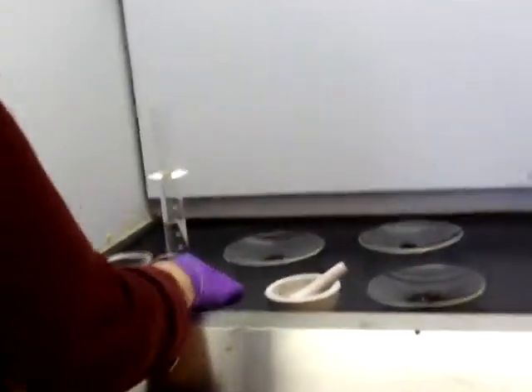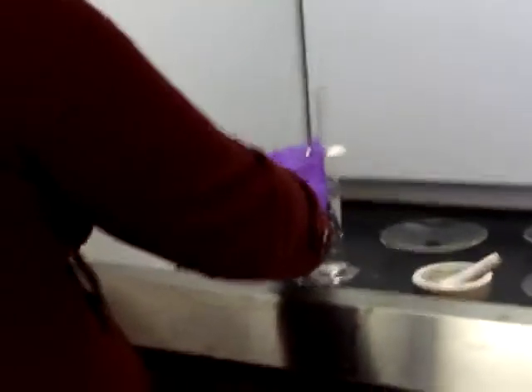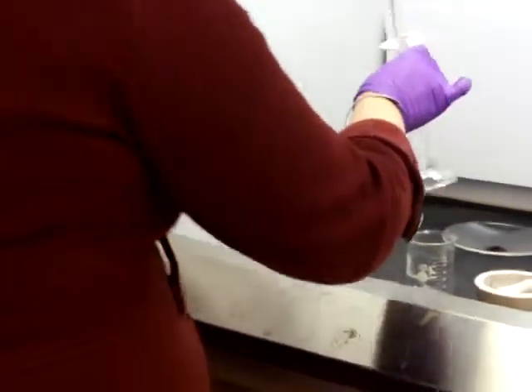I have 50 milliliters of each. It's gonna bubble. We're all gonna die. It's gonna bubble lots. Let's find out if it bubbles lots.